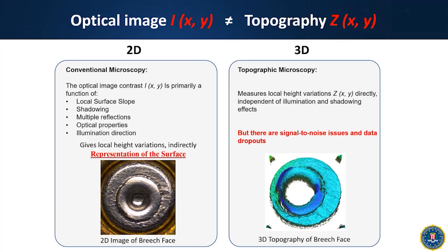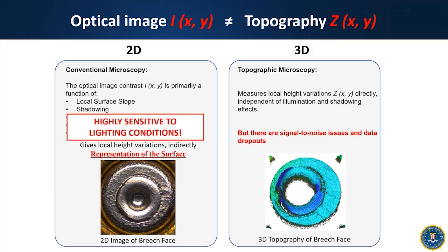You're actually not really worried about how shiny a surface is, and you're not worried about which direction the light's coming in, because 3D measurements are able to generate a digital representation of the surface and be pretty agnostic about the type of samples you're measuring.